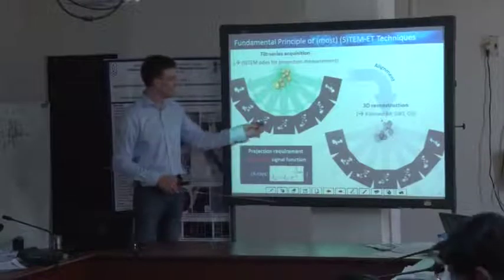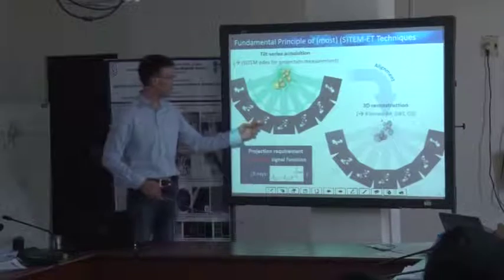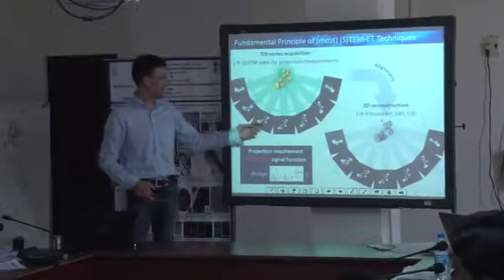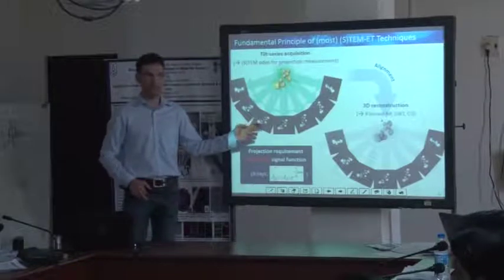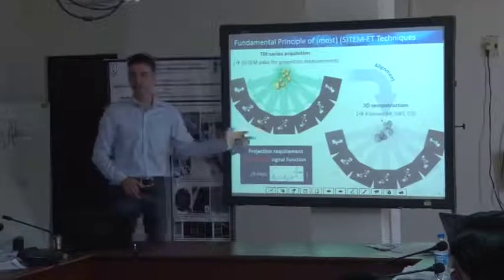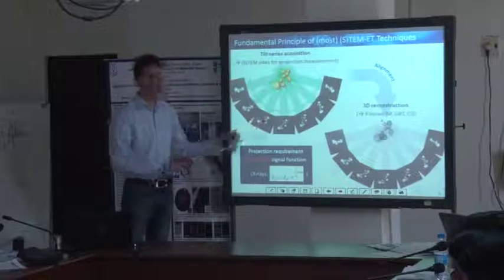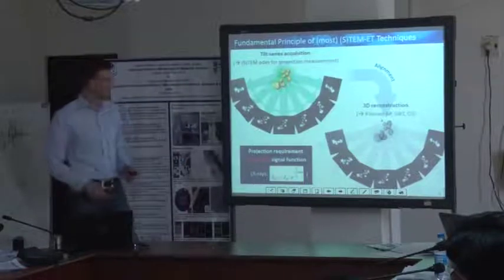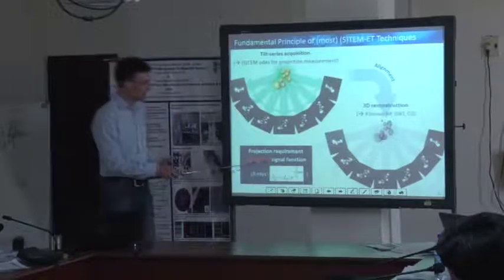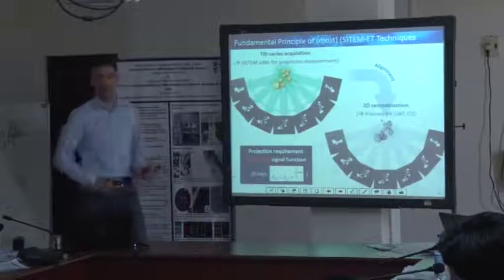The physical property here might be the local density, but in principle it is based on the interaction. And the interaction that we have here is in principle the scattering, our atomic scattering interaction with the material. And we definitely, or best case, in principle, for reasonable reconstruction, we need a monotone function.